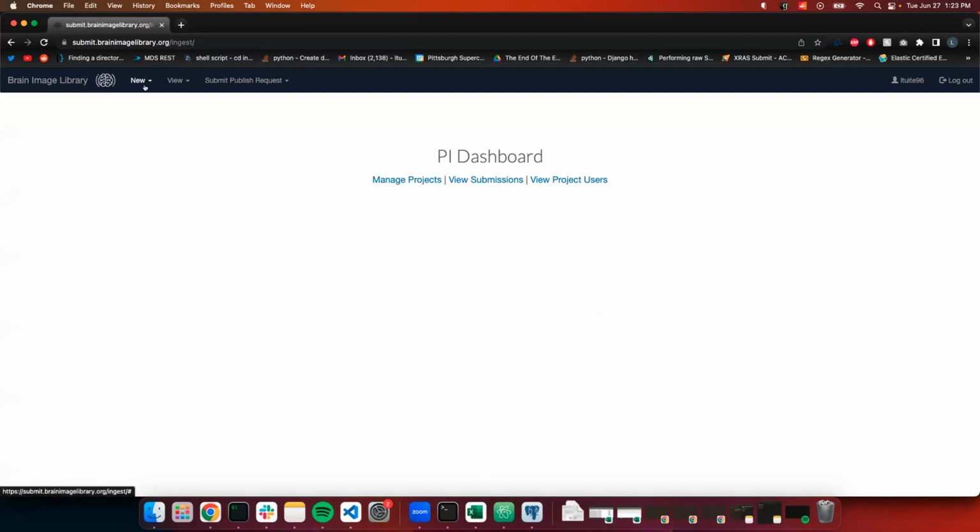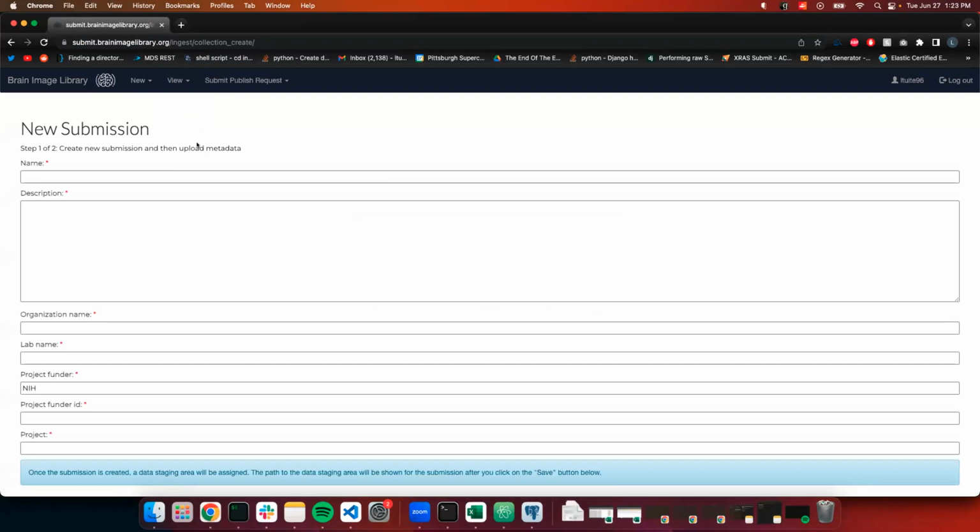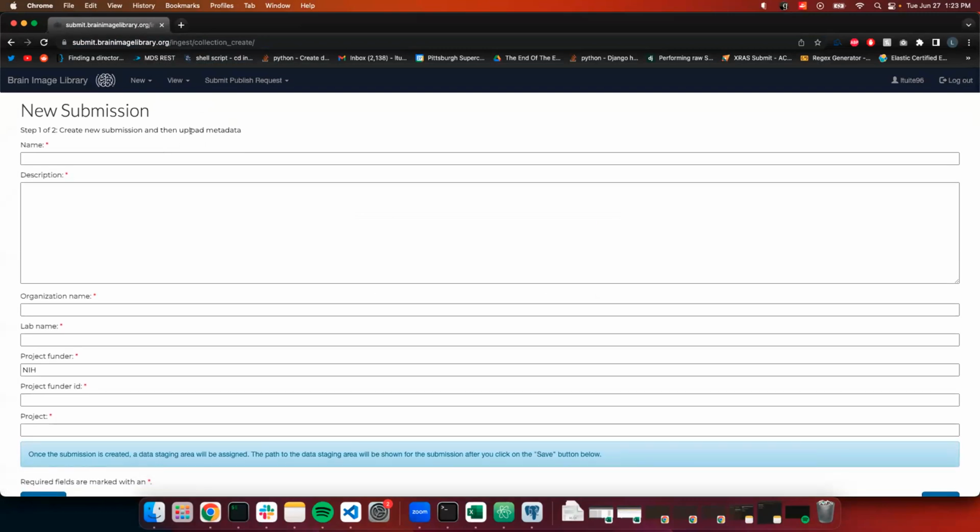So if I want to go ahead and create a submission, I'll go to new submission. So here's the form to create a submission. Obviously, the more descriptive you can be, the better. For the sake of the workshop, I'm just going to be a little generic. So I'm just going to say this is the summer workshop submission. My description, I'll say test workshop submission.